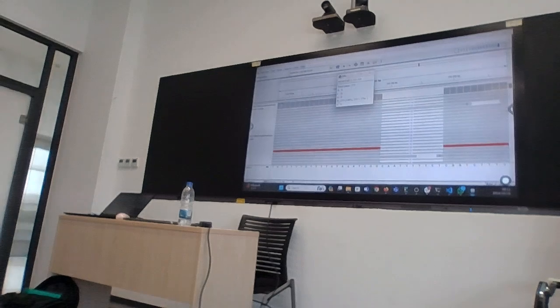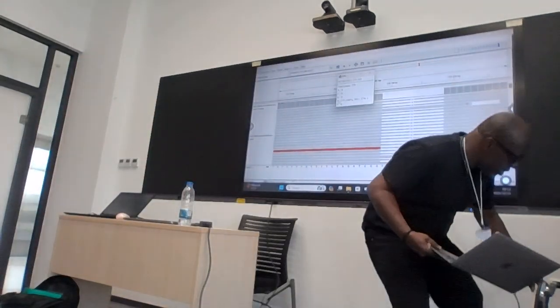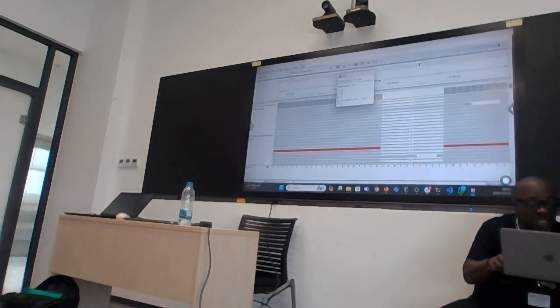What I would look at here is, I haven't discussed this yet, but the tool Squirrel identifies the regions that you should not use in your analysis because of that. So if it's a region that Squirrel identifies as one we should ignore, then we ignore it. But if it's outside of the region, I'd say that we have to consider it.